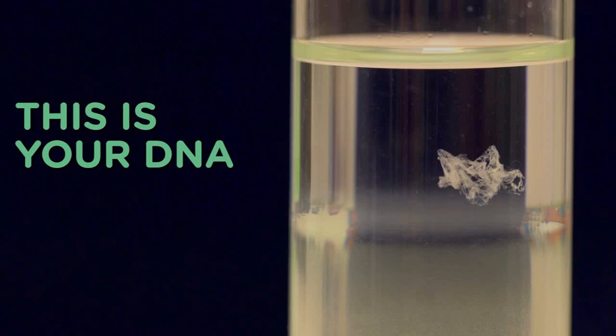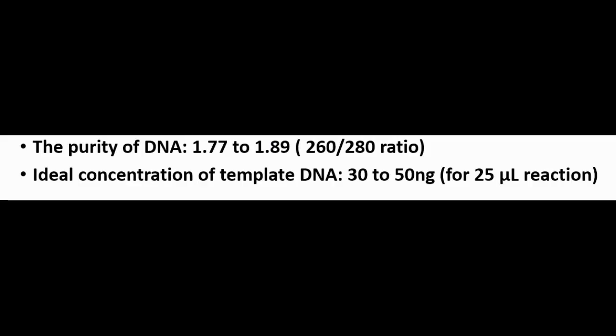It is possible that our DNA is not perfectly extracted every time. Before using it in amplification, purify the DNA using a DNA purification kit, or re-extract your DNA. Ideal concentration of template DNA: 30–50 nanograms for a 25 microliter reaction. The purity of DNA: 1.77–1.89 (260/280 ratio).